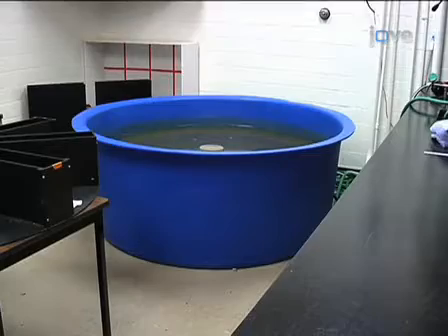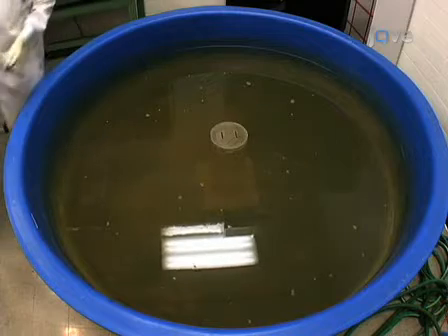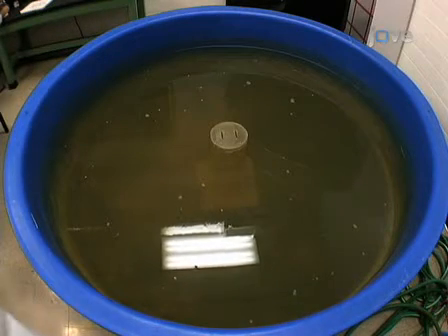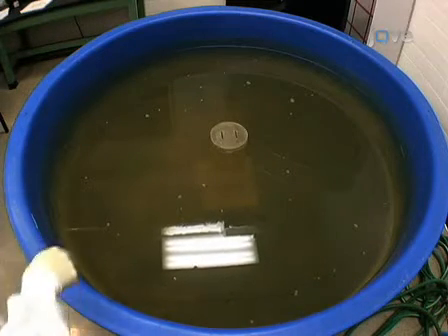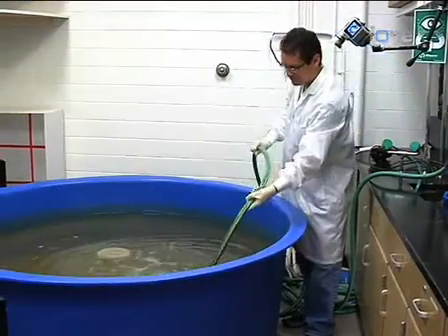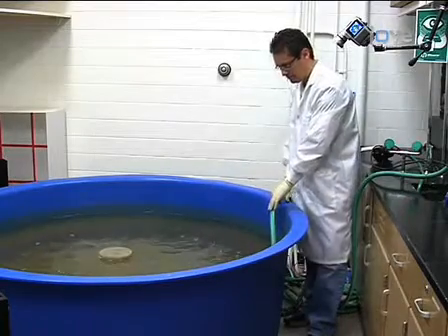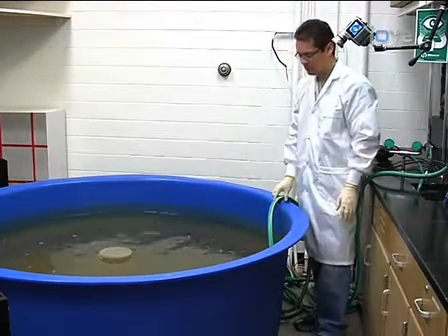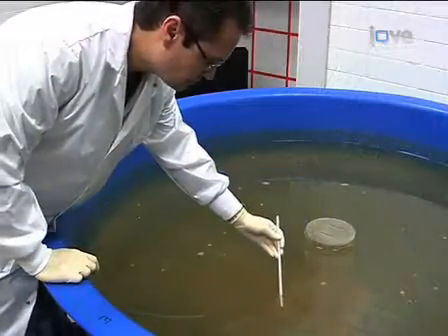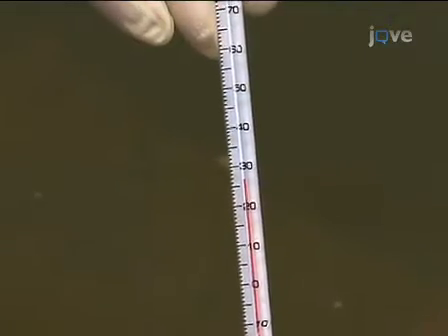The main component of the water maze setup should be a round pool, about six feet in diameter and about three feet deep. If you are recording the task with a video camera, make sure all sides of the maze are within the camera's field of view. Fill up the water maze with tap water, which should be close to 26 degrees Celsius. This may take several hours, so it should be done well in advance. Periodically check the water temperature so it's plus or minus one degree of 26 degrees Celsius.